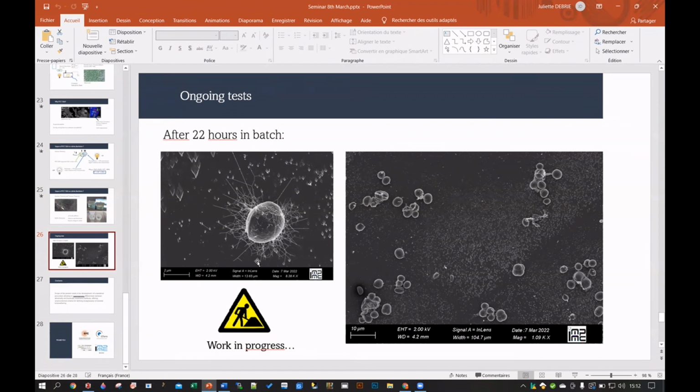Well, we bathed them in several baths, including ethanol and so on, with agitation, and they really stick. But for sure we lost some of them, because at the beginning the surface was green, and this is what remained after 22 hours.